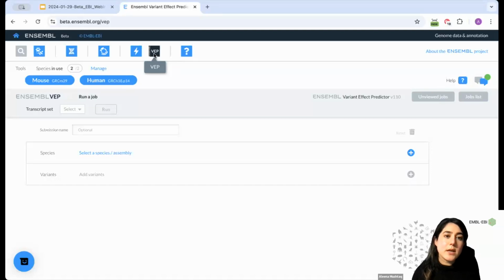And then it is going to give you information on where these variants fall, what genes and transcripts your variants have affected. If they're already available in the database, then we will give you information on their allele frequency, so population genetics data, phenotypes associated, any pathogenicity scores, and so on.